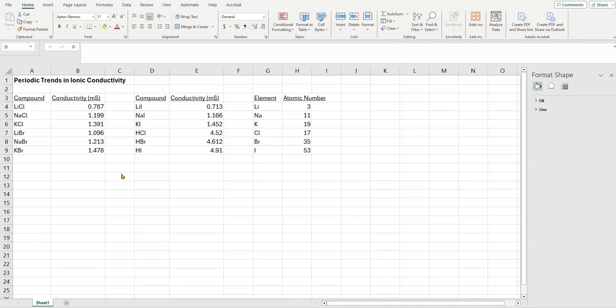I am not going to explain these models in this video. You can read in the lab manual about that, and you can look over your notes from class. We talked about that there. All I'm going to show you in this video is how to make the graphs.